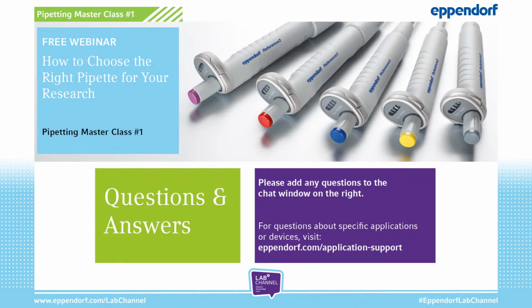Okay, thanks for that. I think that answers the question quite well. The second question I'd like you to answer is from the audience, which asks, why do pipettes drip? You mentioned it shortly in the beginning, but they are not sure if they got it right. So maybe you can explain shortly again why pipettes sometimes drip from the tip. Yeah, of course. I'll try to explain once again.